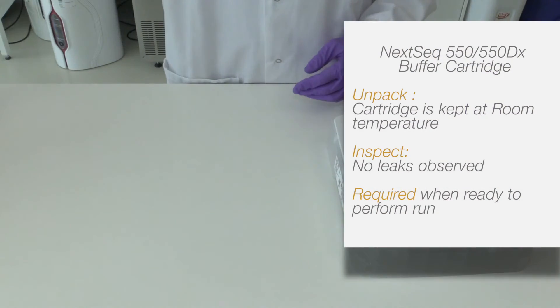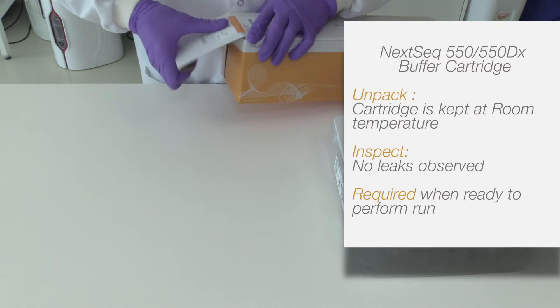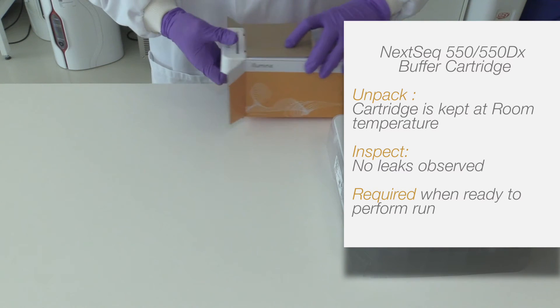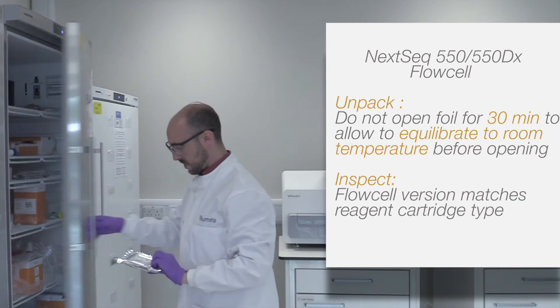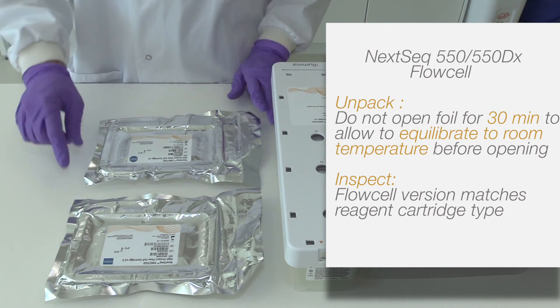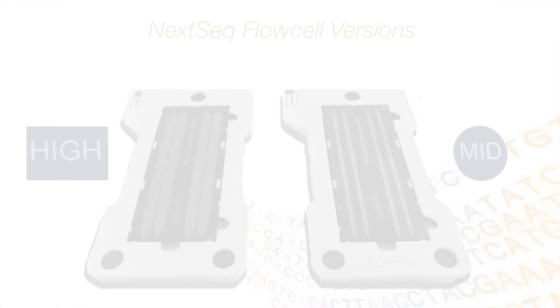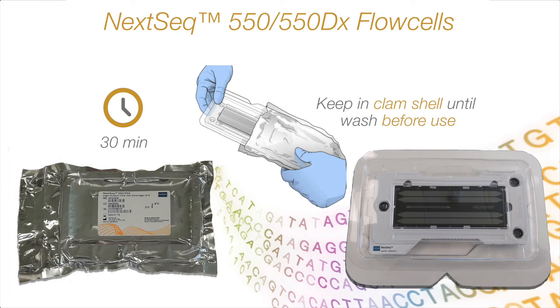The NexSeq 550 550DX buffer cartridge is kept at room temperature. Prepare the NexSeq 550 550DX flow cell by removing the package from 2 to 8 degrees storage. Set the unwrapped flow cell package aside at room temperature for 30 minutes without opening the foil. If the foil package is intact, the flow cell can remain at room temperature for up to 12 hours. Avoid repeated cooling and warming of the flow cell, and check correlating versions between the NexSeq 550 550DX flow cell and reagents. Remove the flow cell from the foil package just before cleaning it and setting up the run.